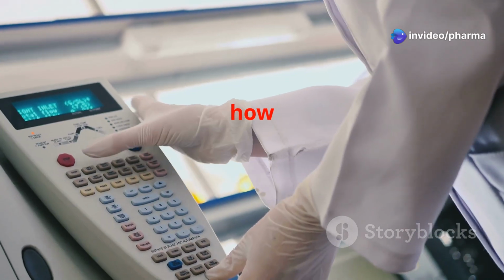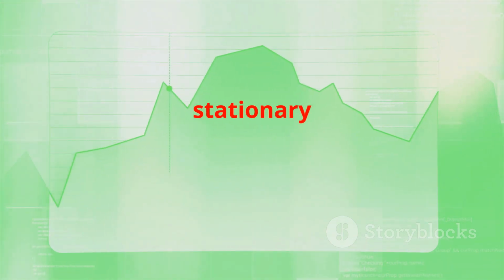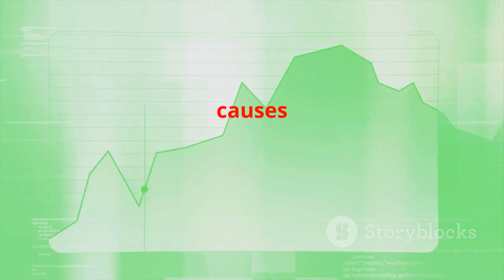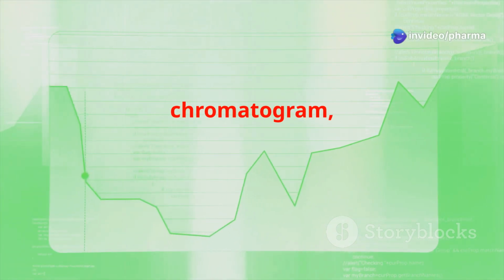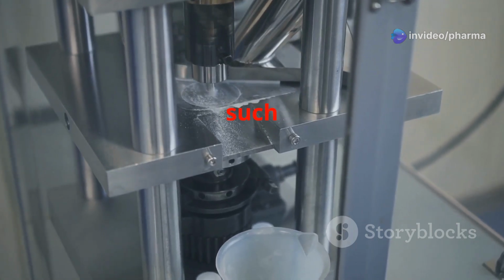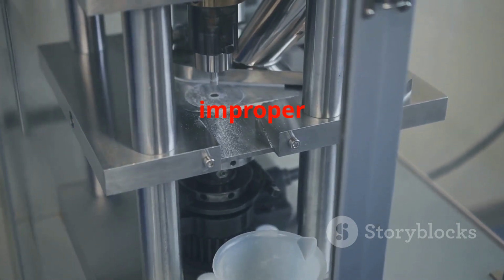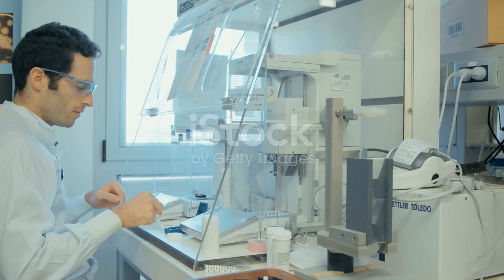It helps evaluate how well the column and system are performing. A tailing peak indicates that the analyte is interacting with the stationary phase in a way that causes the peak to tail or extend toward the later time of the chromatogram rather than being symmetrical. This is often caused by factors such as poor column packing, improper mobile phase composition, or sample matrix issues.